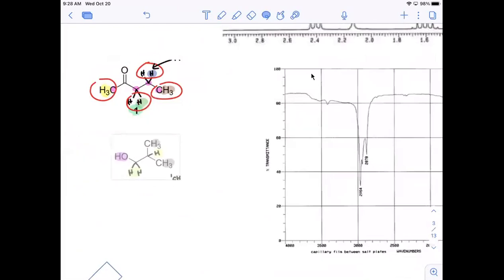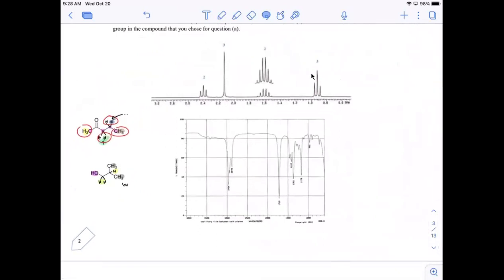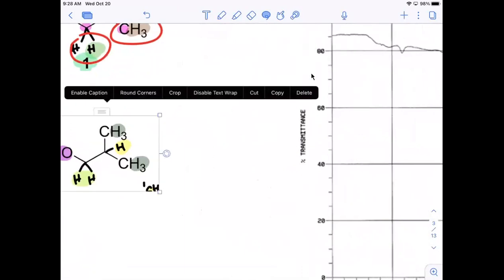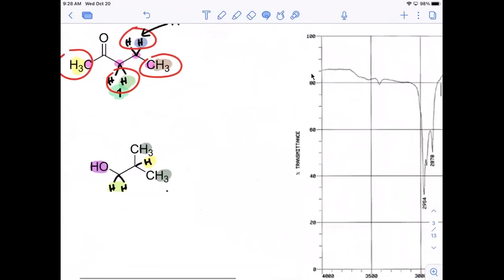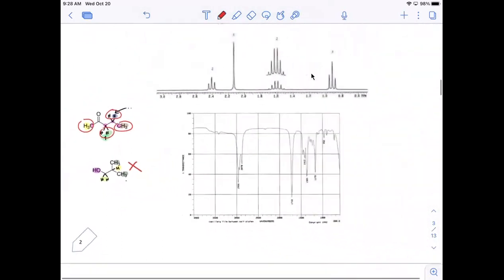All right. So first of all, we can rule out right away the alcohol. Crop that out. 1 second. All right, we can rule this out because in the infrared, which is down here, you do not see an OH stretch. The infrared would show alcohol somewhere up in here, right? It'd be a really broad stretch. You're gonna see it on one of the next examples. So that's out, right?